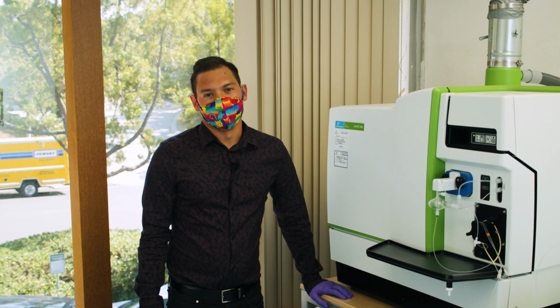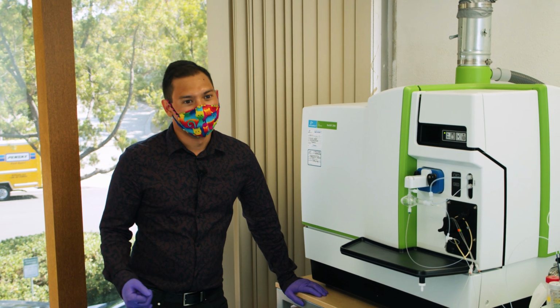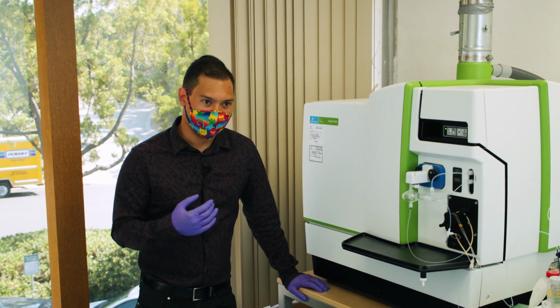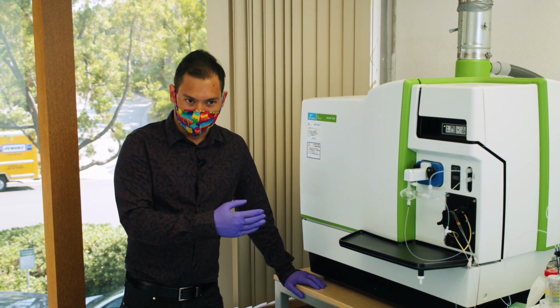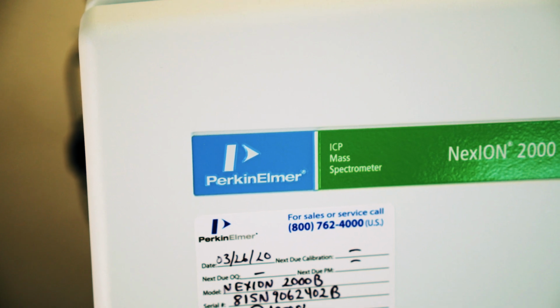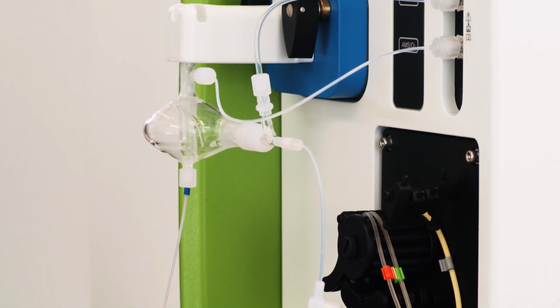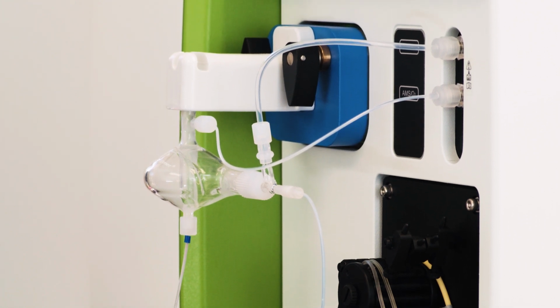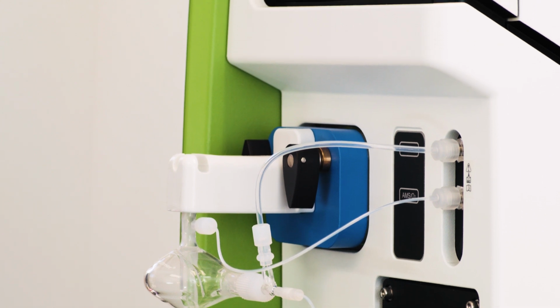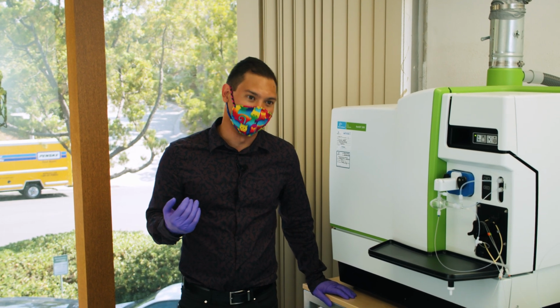Here we are in the heavy metals analysis room, and this is an inductively coupled plasma mass spectrometer, or ICP-MS. And what this does is it utilizes a plasma source in order to ionize our metal samples, and basically we're going to be quantifying the big four heavy metals. That's arsenic, cadmium, lead, and mercury. These things have various action levels depending on what type of route of administration. So if you're eating it, it might be a bit higher than, say, if you're inhaling it. But ultimately, it's an important safety test for cannabis and cannabis products.